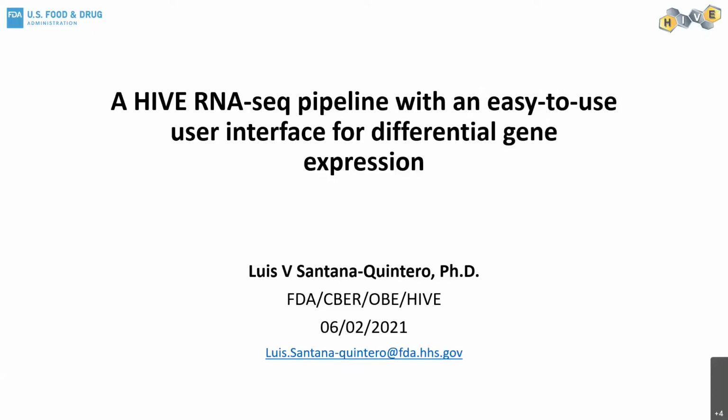Today, I'm gonna spend some time talking about the RNA-Seq pipeline that we have integrated in the HIVE interface for differential gene expression. My name is Luis Santana Quintero. I'm with the HIVE team inside CBER in OBE, Office of Biostatistics and Epidemiology, and the HIVE.